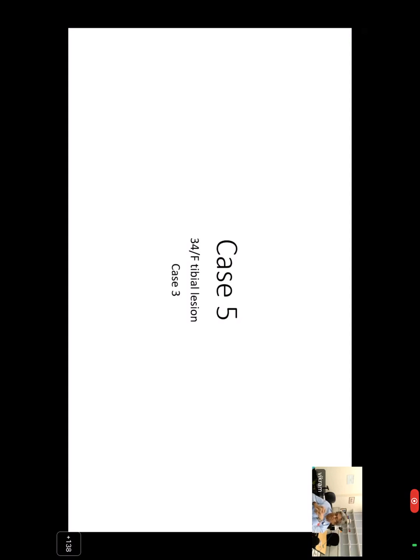It is a fallacy that you cannot freeze bone tumors. You cannot freeze cortical bone, yes, but you can freeze cancellous bone and you can freeze most bone tumors unless they are an ivory-like osteosarcoma, and that has saved us on many occasions. Not infrequently, we'll tell our surgeons, I'm not sure what this is, stop at this point, because you do not want to be curetting an osteosarcoma.